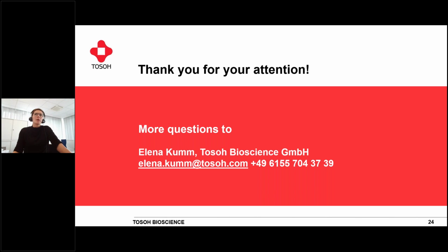Often, on homepages, if you Google for columns, you see recommendations for the sizes of molecules, or you see application notes, for example, where you can see what has been done with this. Is it suitable for the size of my sample? If it's totally different, then don't do it. We also have columns that are more suitable for biomolecules and some are more suitable for polymers. So just be aware of what you want to purify and what is recommended for the column.